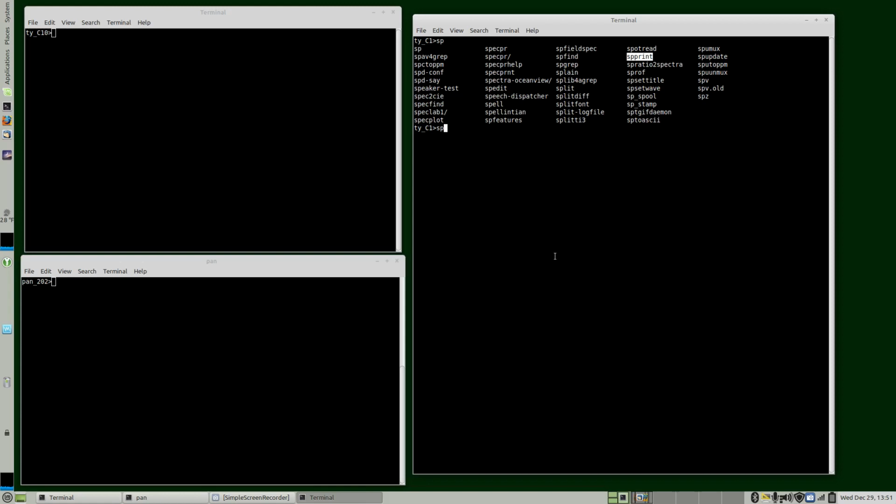But there's also a number of other programs, and I'll illustrate this on the PSI computer pan, which is this window over here. There's Spec Find. As users develop more and more spectral products, taking lab data, telescope, spacecraft data, and put them into the SpecPR format, the SpecPR system catalogs a database of what's available, and we can search that database.